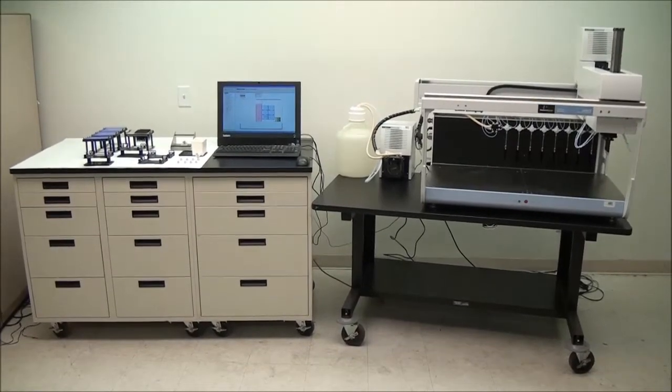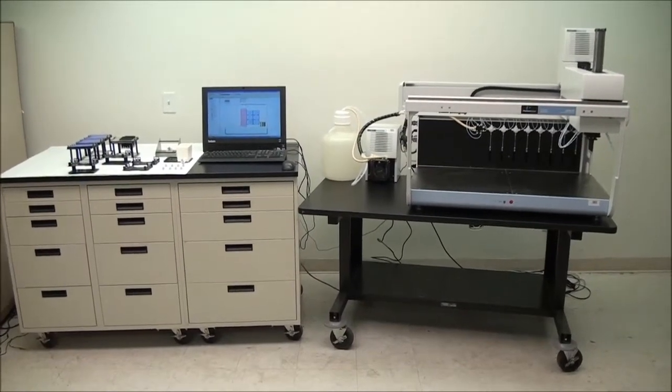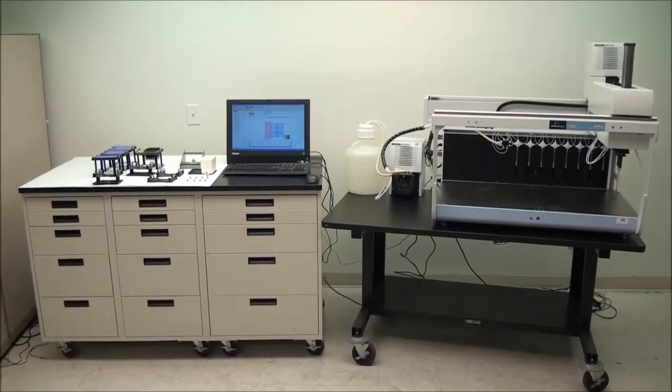Today we have a Perkin Elmer JANUS 8-tip Varispan. It's an automated liquid handling workstation. We got this liquid handler in and we brought it into our shop. Went through it, made some adjustments. We greased some axes on it to get it running nice and smooth.